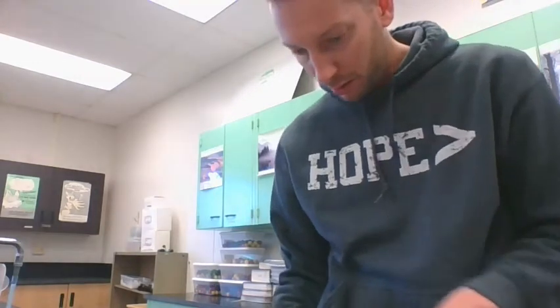And that's pretty close, isn't it? So we have 0.7 for theoretical, and the actual is 0.59 grams. Let's just go ahead and do this math while we're here. So 0.59 divided by 0.7, and that looks like 84% yield. Right, that's a pretty good total.